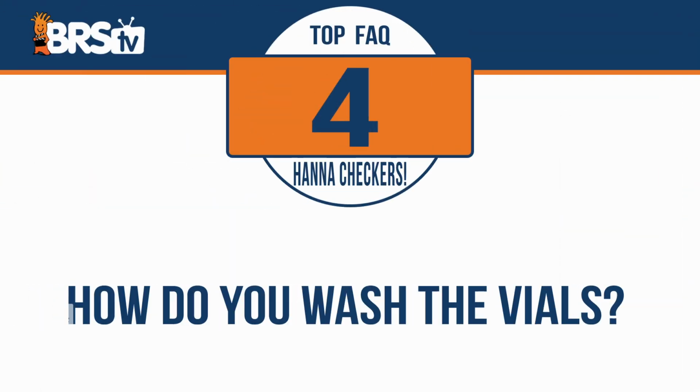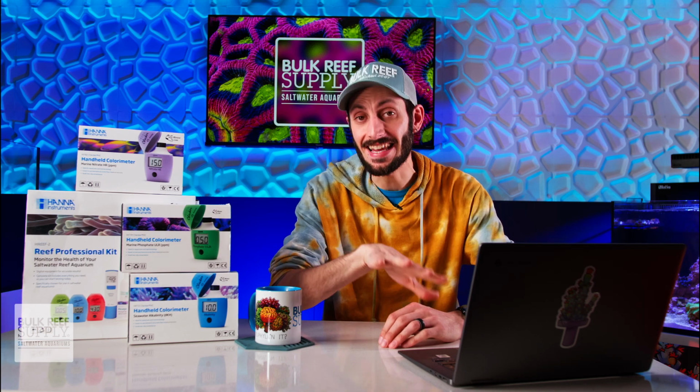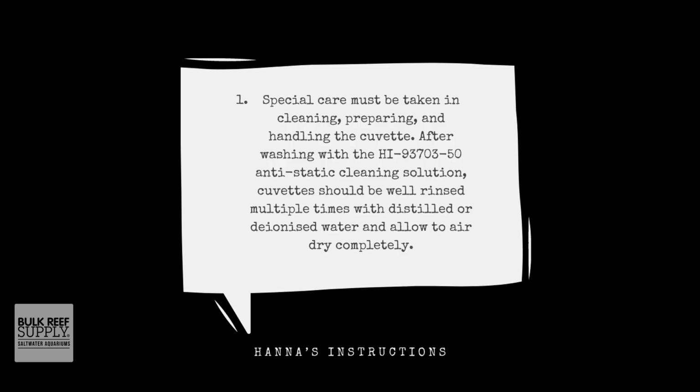How do you wash the vials? All right, so I'm gonna give you 2 answers. According to Hanna's instructions, special care must be taken in cleaning, preparing, and handling the cuvette. After washing with the HI 9370350 anti-static cleaning solution, cuvettes should be well rinsed multiple times with distilled or deionized water and allowed to air dry completely.